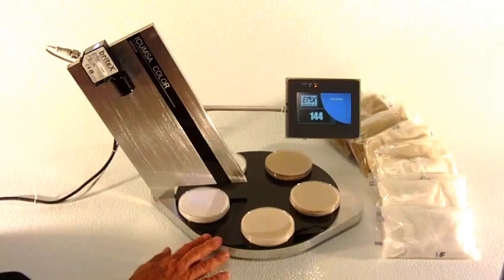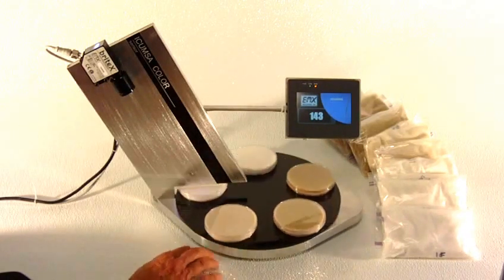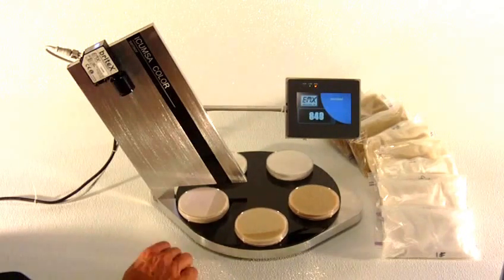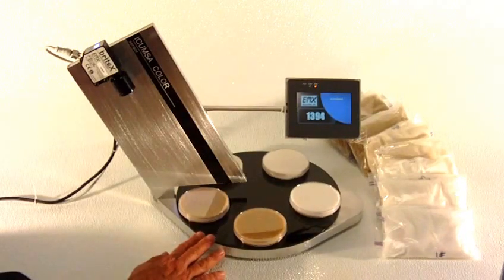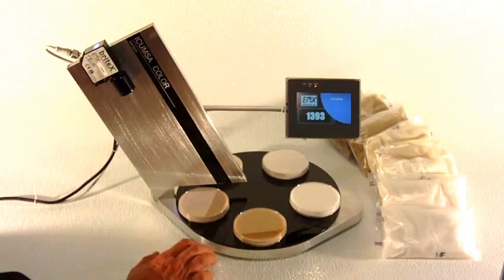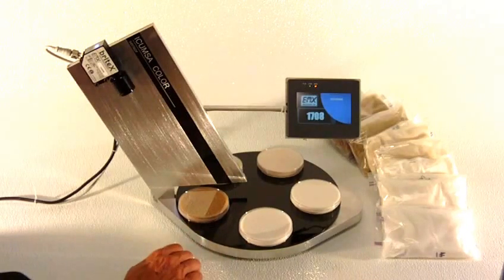A little bit darker, lower grade sugar is measuring around 142. Again a little darker — 847. Again darker — 1390s. And finally the darkest sample we have is around 1700 ICOMSA.